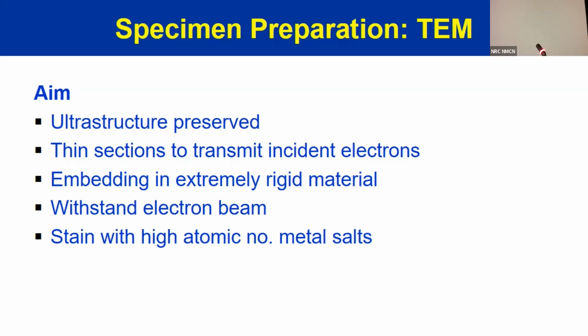It goes through a lot of processing steps. One of them, and then it is embedded in what? The tissue is embedded in paraffin. It is embedded in paraffin, and then you cut sections and look at them. You remove the paraffin, of course, by methods, and then you stain it and look under the light microscope. So it is paraffin embedded. That is known as formalin fixed paraffin embedded, that is FFPE. But can we use the same procedure for electron microscopy?